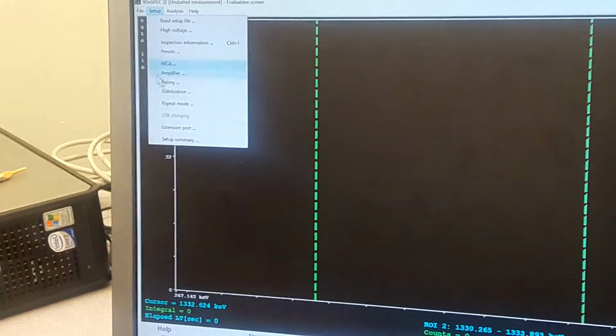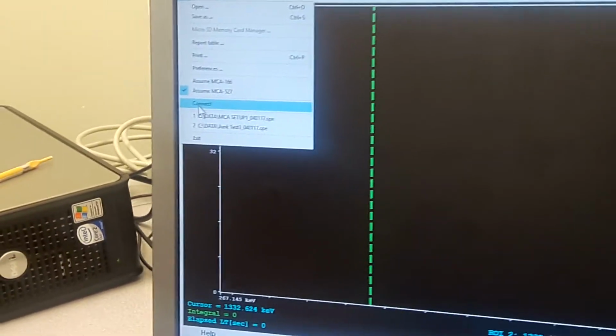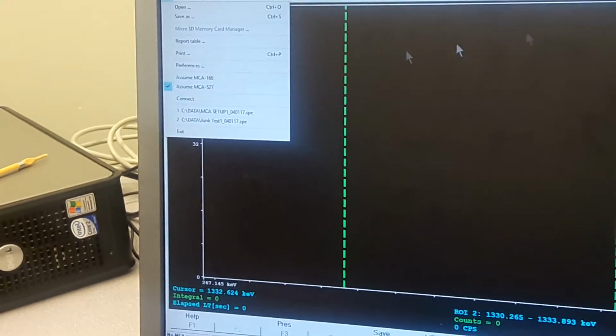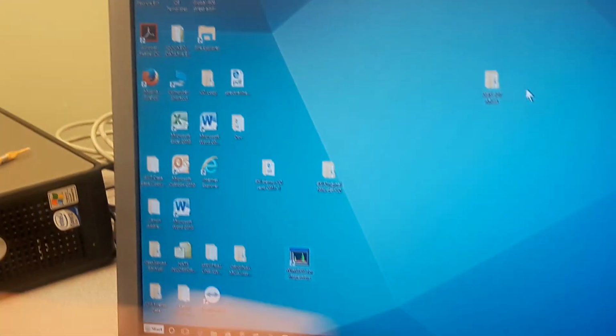And you go to the file and you go to disconnect, because I already disconnected. You can connect or disconnect. You disconnect the MCA and you close it. End of this video.